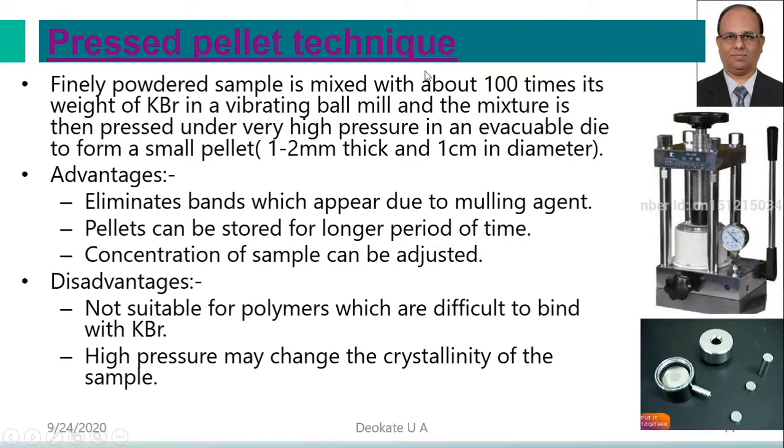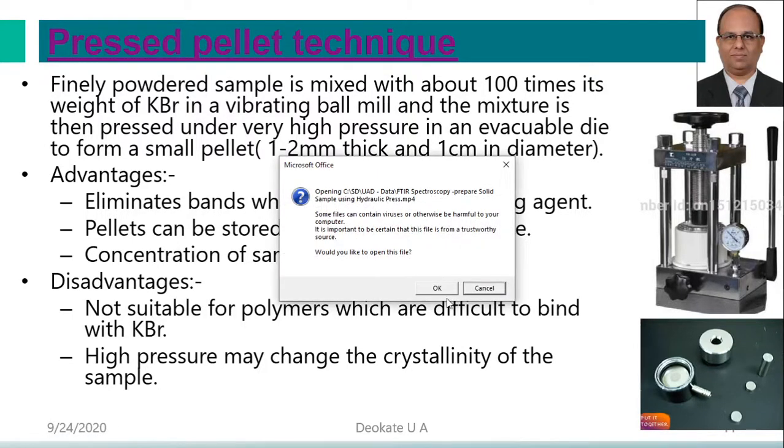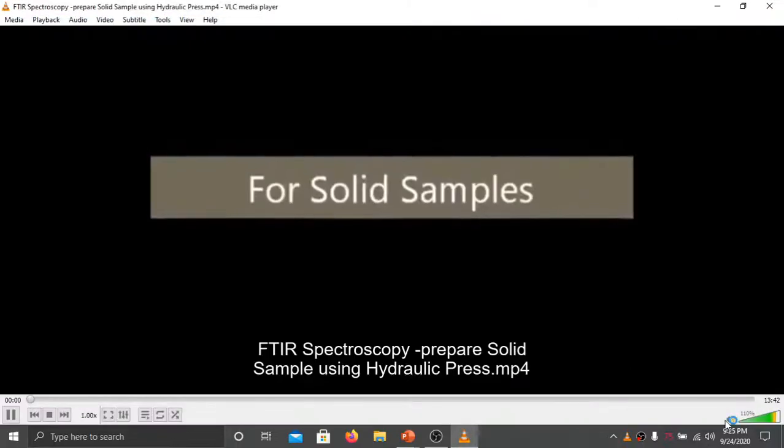For your better understanding, I will show you the dies and punches which are used for forming the pellets, and this is the die pressure machine which will produce these tablets. I will show you the video for better understanding of this device.